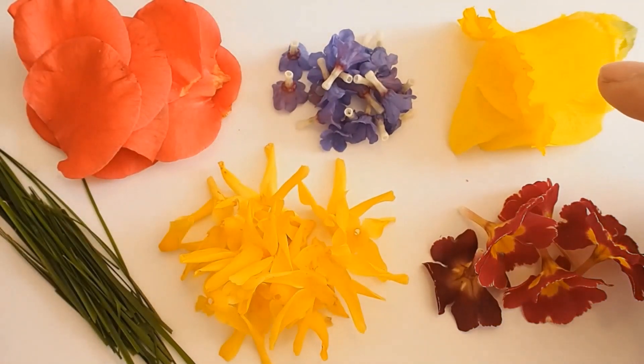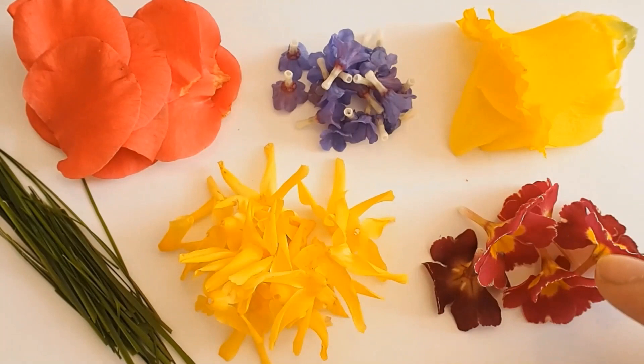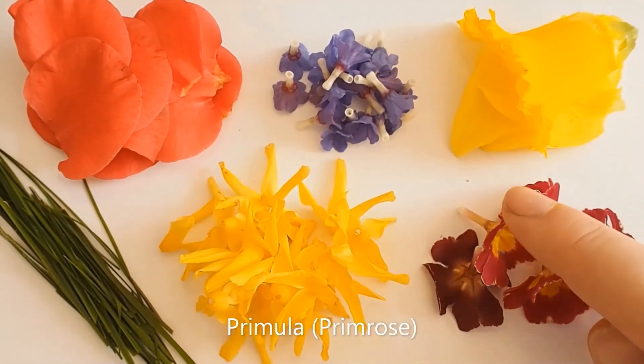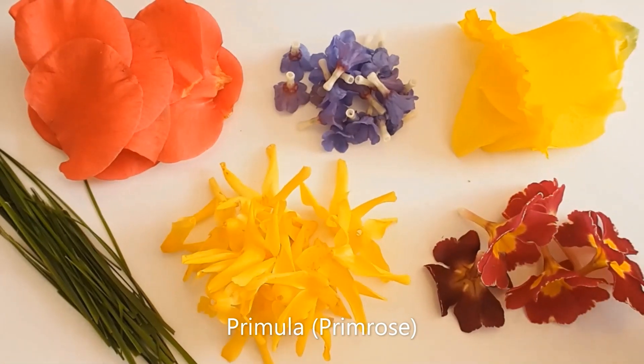And then over here we've got good old daffodil flowers, and I also put the corona in there as well. Narcissus is the Latin name for this plant. And then down here we've got the humble primrose — a really nice red rouge coloured primrose — and its Latin name is Primula.